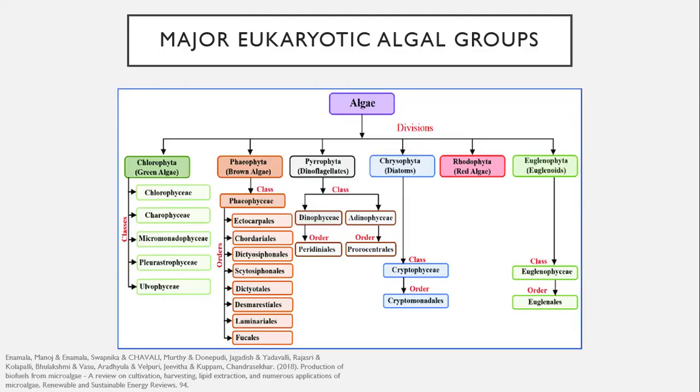Oh, and one more note here, for our purposes, we try and identify the plankton to at least the phylum and then down to the lowest taxonomic level, which is usually the genus.